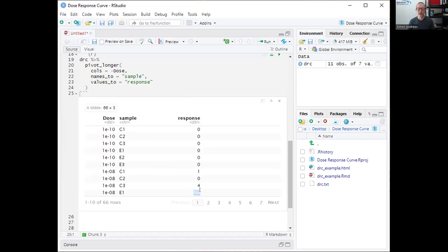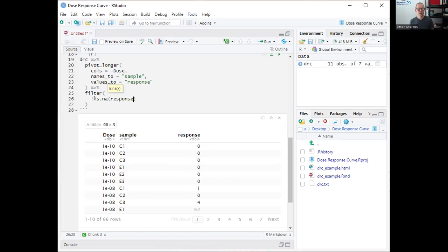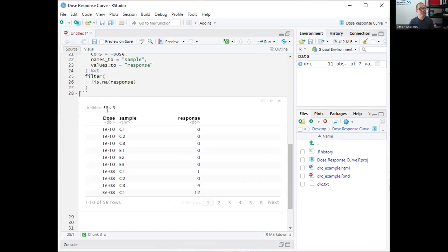Now I can deal with the NA values where I didn't have the same doses in all experiments. Since the structure no longer requires doses to be the same between all samples, I can just filter them out. The condition I'm filtering on is that I want my response values to not be NA — using !is.na(response). At the moment I've got 66 rows with some NAs; when I run this I get down to 56 rows, so those are removed.